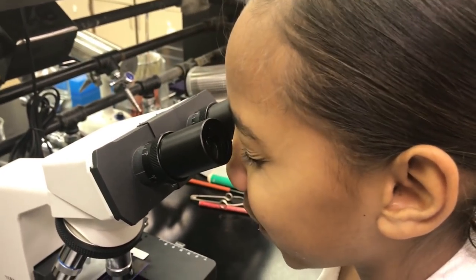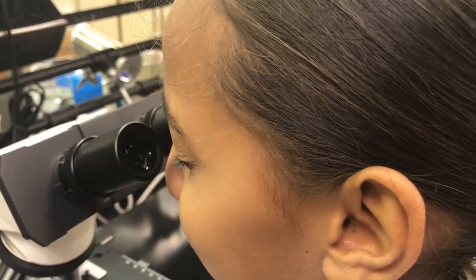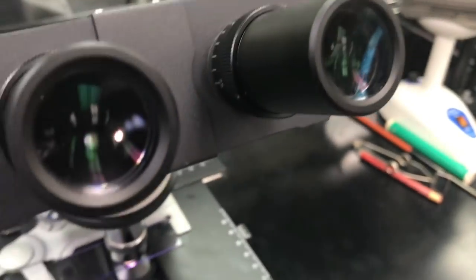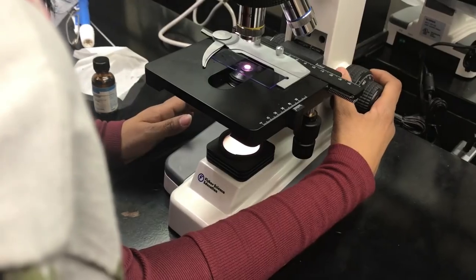Whoa, that's super purple. They look super big. They look like small balls that are attached to each other. They look like clusters of grapes, huh? Uh-oh, that's a super bug. Well, we don't know if it's a super bug. This is what typical staph looks like. They're really small circles.